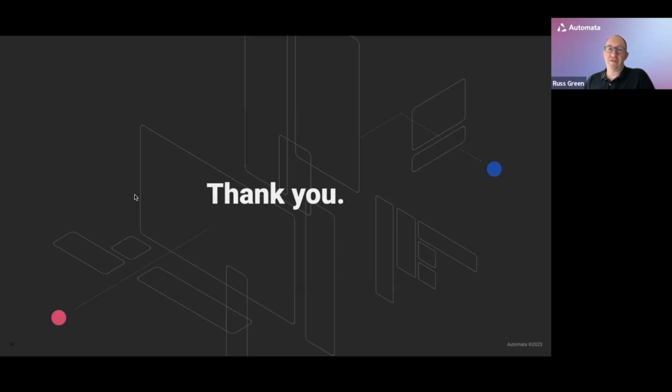So we can do this in the tissue culture world as well, where we can take data such as, I think confluency was mentioned here. We can take confluency data and then make decisions about what we want to do. And that last system I shared is also an example of where we've standardized an experiment for growing up enough cells to hit that 100 assay plates volume, but the exact number of cells we get is a little bit variable, and so we do go through a pooling and counting process to make sure that we are going to dispense the right amount of cells into every single plate. So that's another example of adapting to the biology based on the data we're gathering.